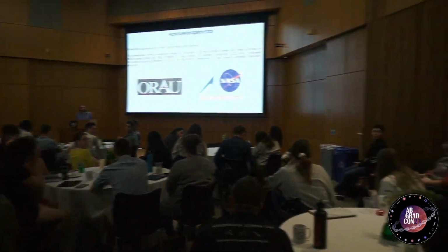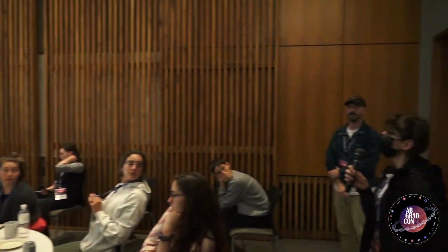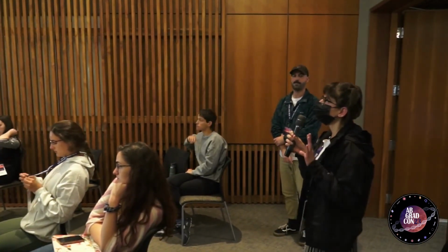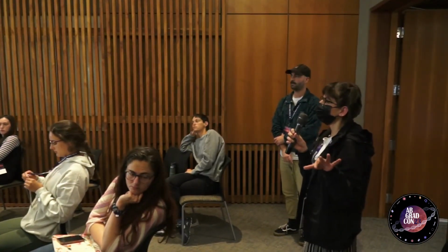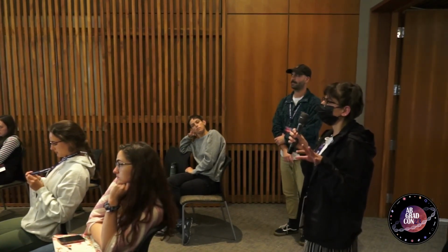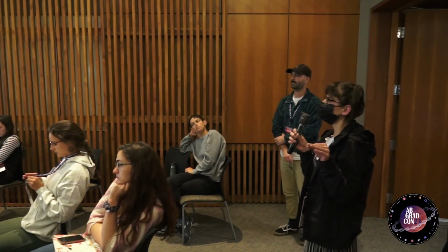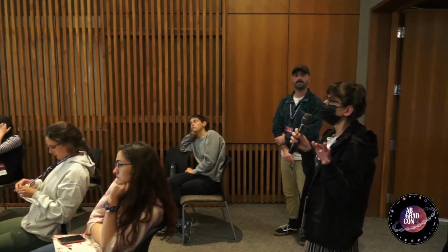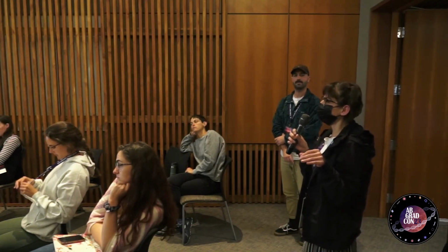Hi, thank you for the great talk. My question is, maybe I missed that you mentioned, how are you going to differentiate any other particles from the living materials? Like, can you specifically stain genetic material or anything biological?